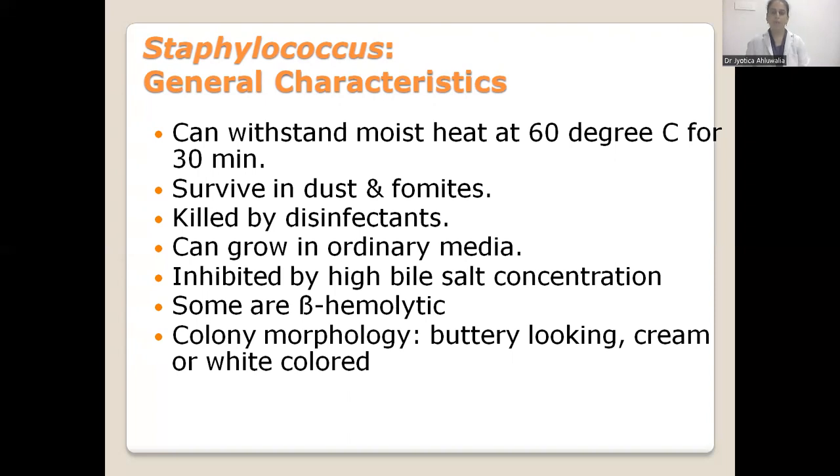Also, they can be grown in various salt media like salt milk agar, Ludlam's media, Mannitol salt agar, and salt broth. To enhance the pigment, the media used is milk agar or glycerol monoacetate agar. Phenolphthalein phosphate agar is the indicator medium for identification of Staph aureus from mixed cultures. Ammonia vapors are exposed on the culture and you get fine pink colored colonies.